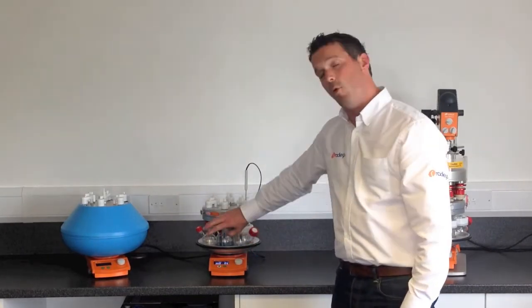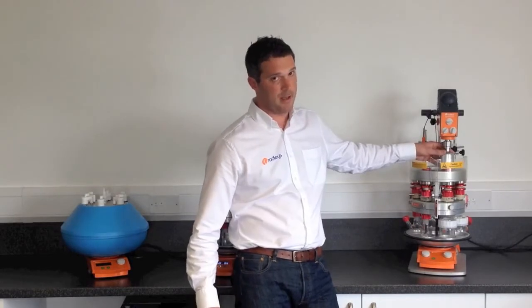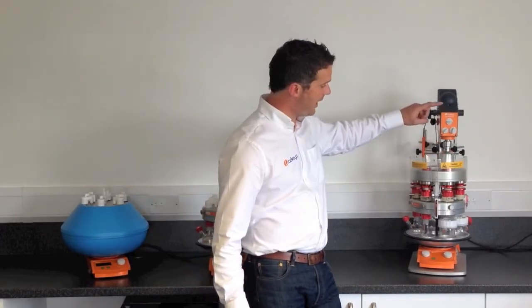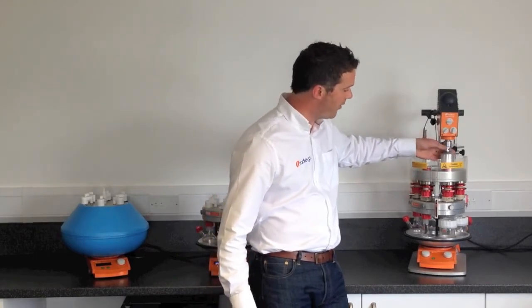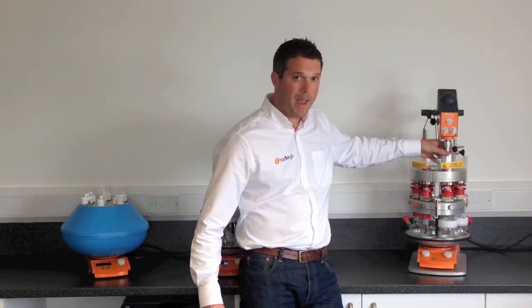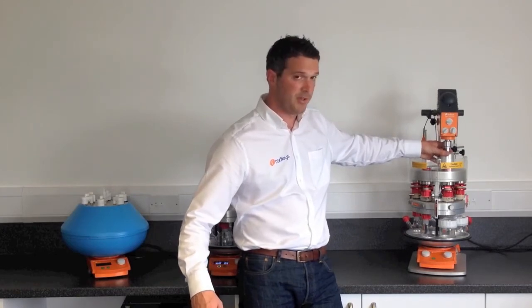If you have a more viscous solution, you can use the Radleys Tornado. This is an overhead stirring motor that allows you to drive all six positions of the Carousel 6 from an overhead motor, providing much more powerful stirring for more viscous solutions or for solutions with solids in.